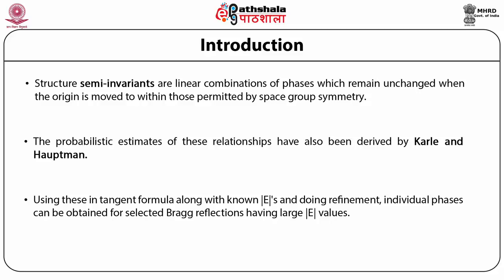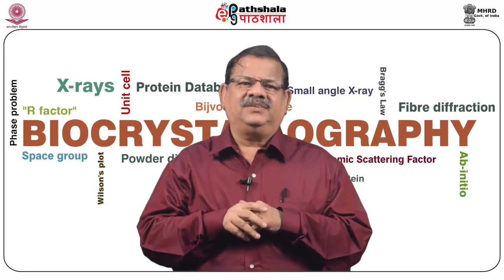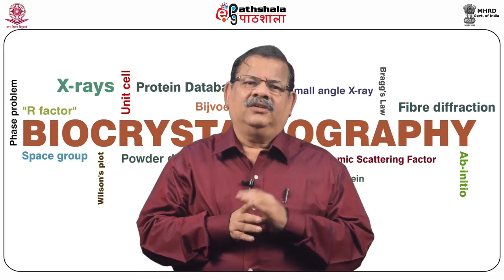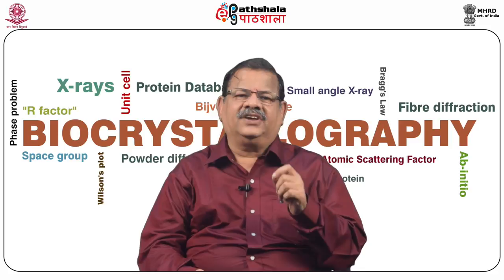Let us now look into the steps involved in the three-dimensional structure determination. Now, for the three-dimensional structure determination of molecules using single crystal diffraction, the first and foremost step is to crystallize the molecule to a dimension of about 0.2 millimeter in length, breadth, and also thickness, in the form of a single crystal without any cracks or clustering.